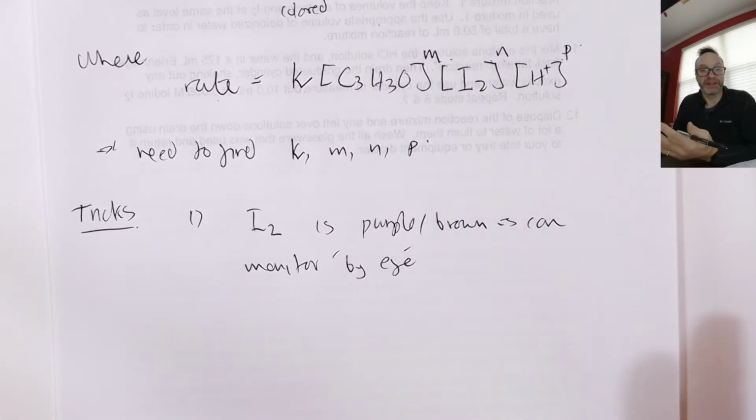It's 2 moles per liter per minute as a rate, isn't it? That's not the numbers we'll use in the experiment, but that's the idea, right? So you can set up an experiment where you know the I2 concentration. You literally measure with a stopwatch how long it takes for the color to disappear. Concentration divided by time is the initial rate, and we'll show you a trick again in a second. Initial rate for I2 disappearance.